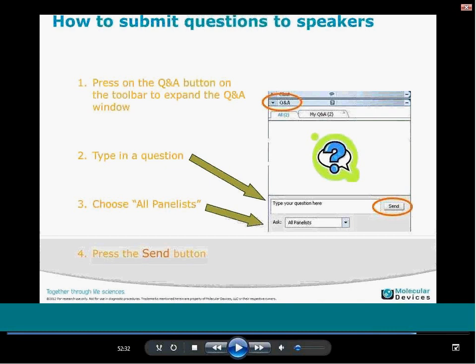Question regarding application modules and their availability inside the custom module editor. Actually, all application modules that are active on your dongle for your analysis will be present in the custom editor when you load it up. On a daily basis, you would use the custom modules to work with masks.